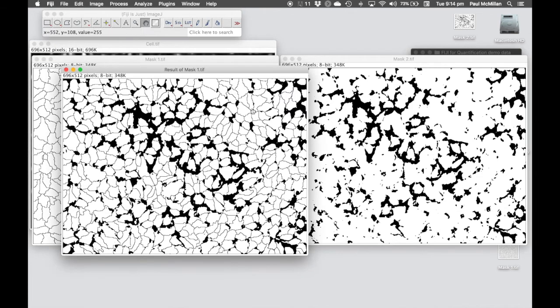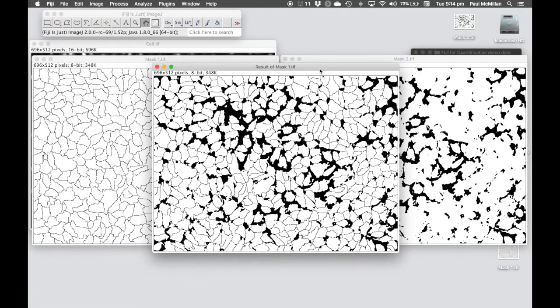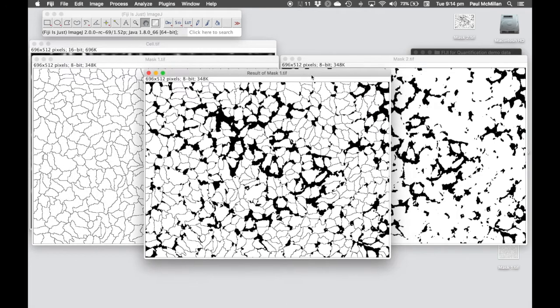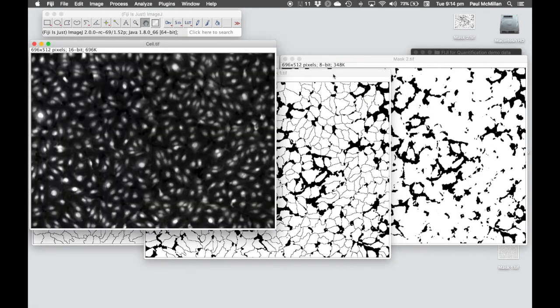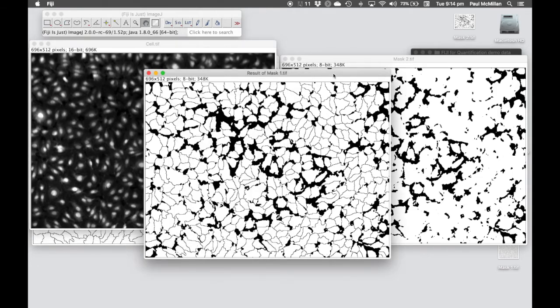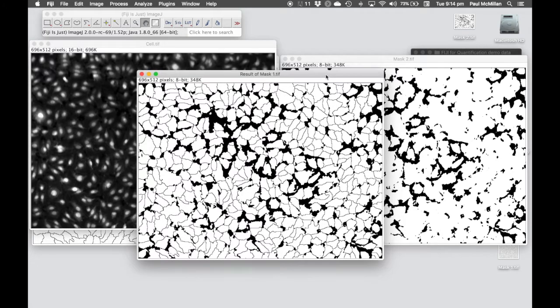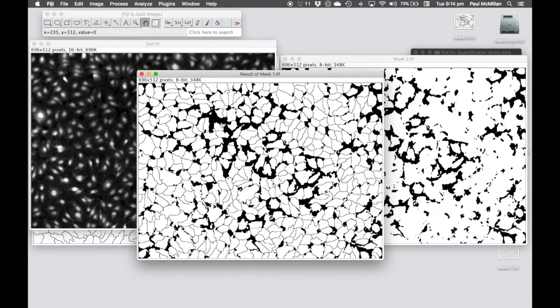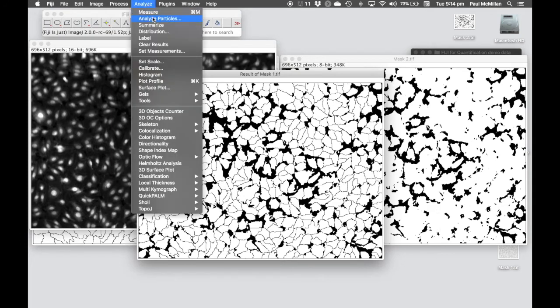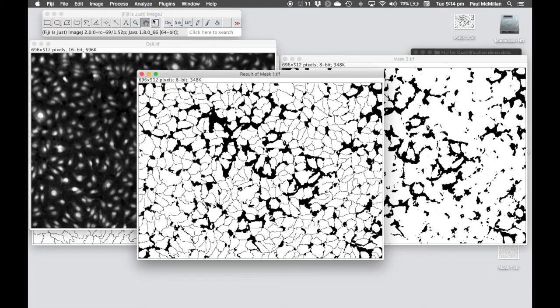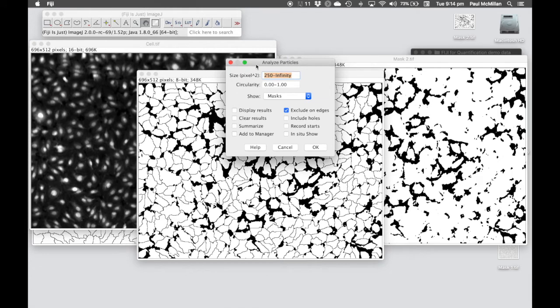If we click OK, we're getting this, which is looking a little bit more like segmentation of our original data. Now again, we're going to clean it up. We've got a few little pieces in here, and we can use the Analyze Particles tool to filter that out.